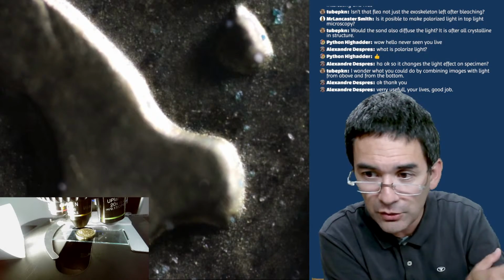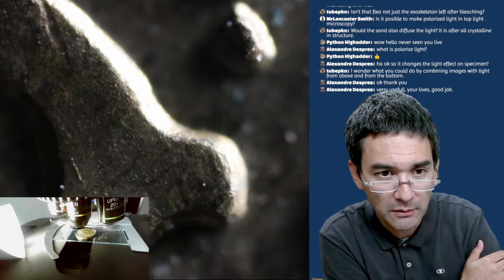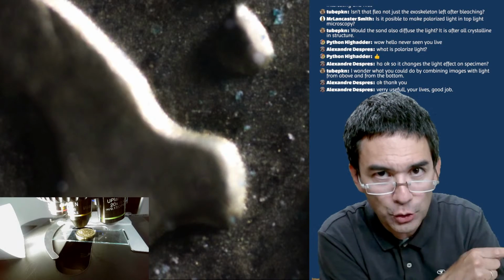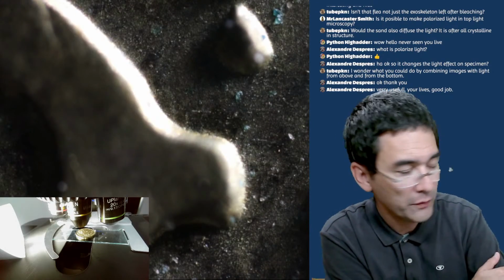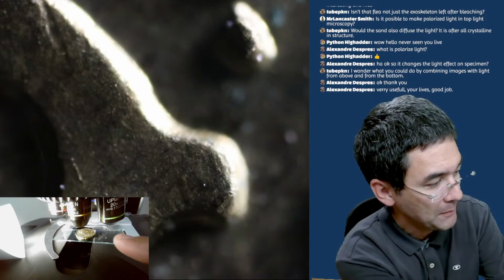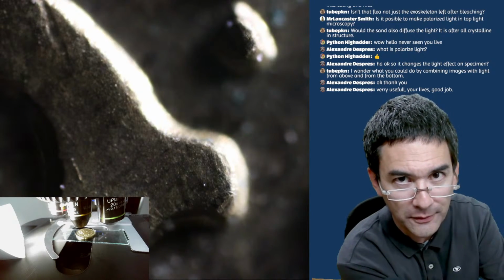And this is something that you can definitely do. Yeah, the other day I made a video where I showed you how to do this with a free software. However, there is even an advantage here compared to stereo microscopes, which I want to tell you. And that is the following: when I focus and raise the stage up and down, like I'm doing right now, okay? Because the stage is in the same axis as the objective, there is no horizontal shift.